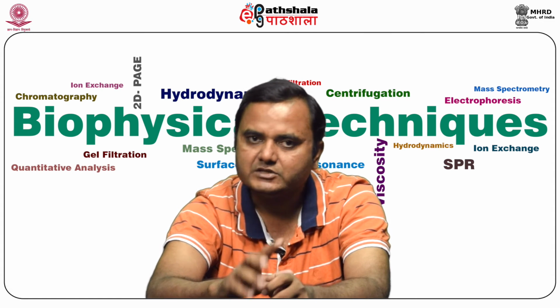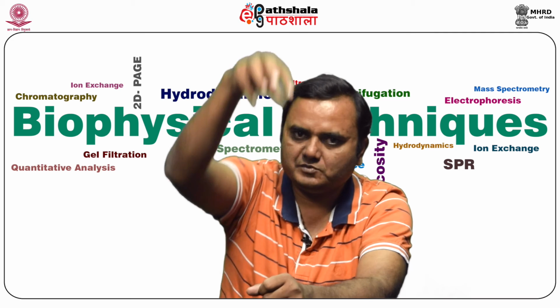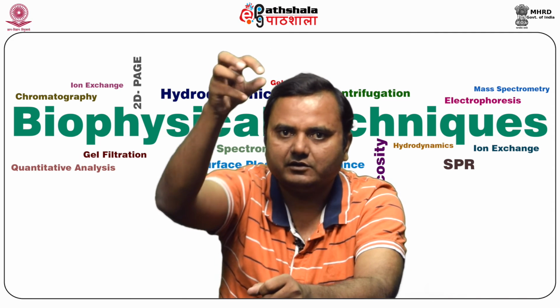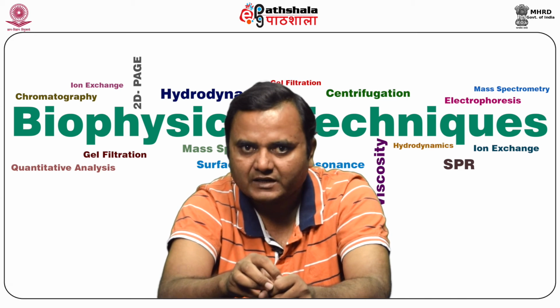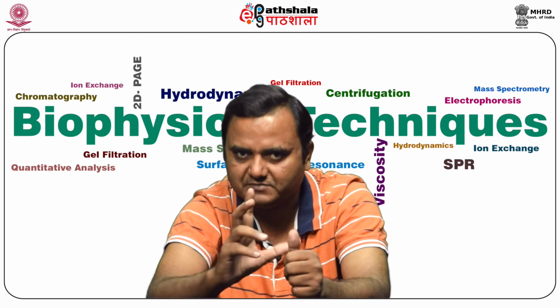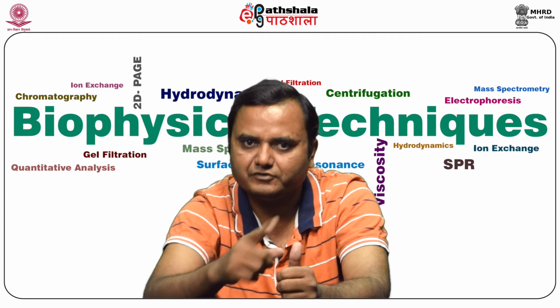So what people do: a tube is taken and increasing density is created from the lowest to the highest side, and then the sample that has to be separated is mixed throughout the tube, and then the centrifugation process starts.